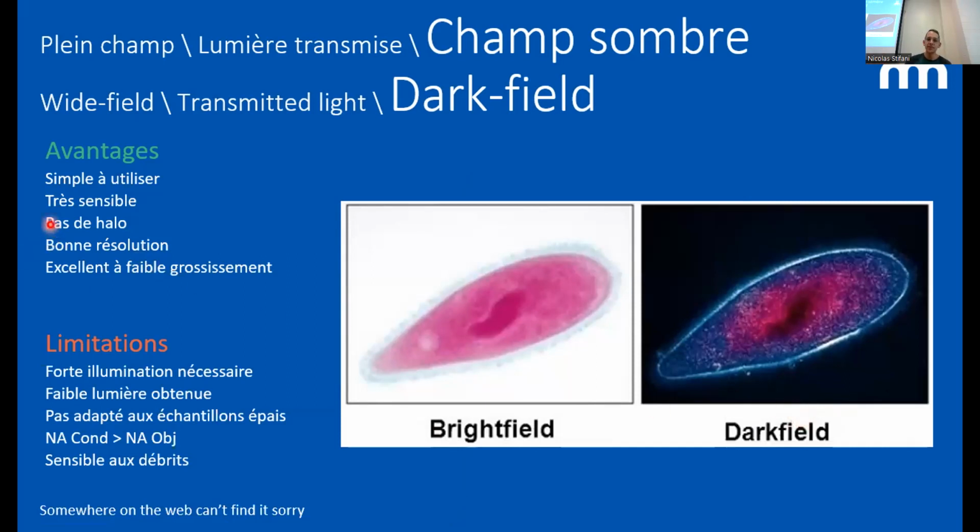It's very sensitive. It gives you a very dark image around, but you can see your sample quite clearly, and it has a very good resolution. It works very well with low magnification microscopes. And what I really like is that you can see a lot of things, particularly dust and things that are unwanted. So you usually don't have a very clear image like that, but at least you see almost everything.